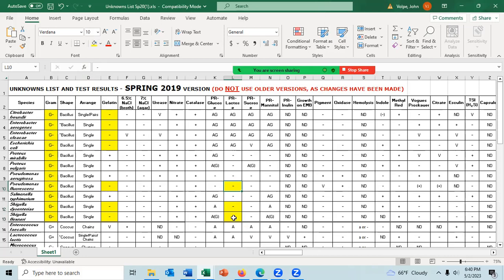And this one could be a possibility. So PR mannitol might be a test you'd run. This is unusual then that you can actually get your answer after doing that one test. Most of them will be something else. Another good one would be, this isn't a bad one, nitrate. It narrows it down to 2 possibilities, this one or these 2.